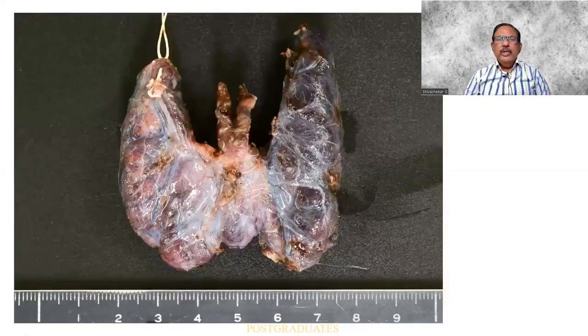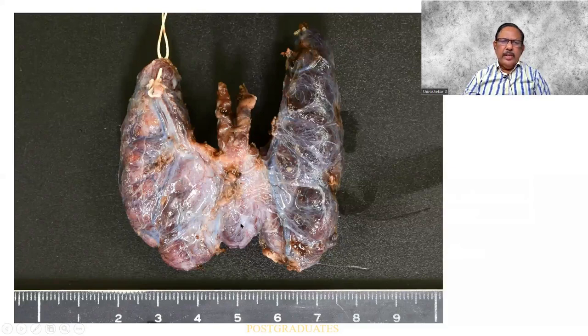Look at this. So describing a specimen will be mandatory. You are supposed to mention what type of thyroidectomy it is and what are the lobes that you are seeing. What is the measurement of each, and whether the surrounding capsule is transparent? Are you able to see the underlying parenchyma? Is it smooth or is there a bosselation? And what are you finding at the isthmus? A bit of the pyramid is also seen over here. Similarly, the posterior surface. Any additions can be specifically mentioned. Measurements are mandatory, weighing is needed.